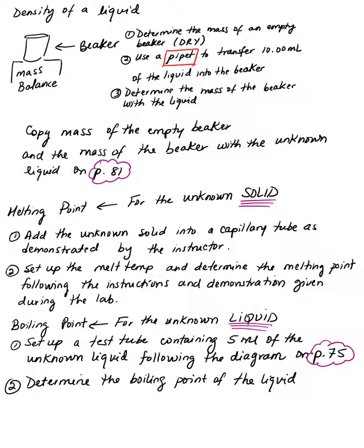And using that, you're going to be determining the boiling point, which is that temperature at which your liquid is going to evaporate, okay, or it's going to be converted into a vapor.